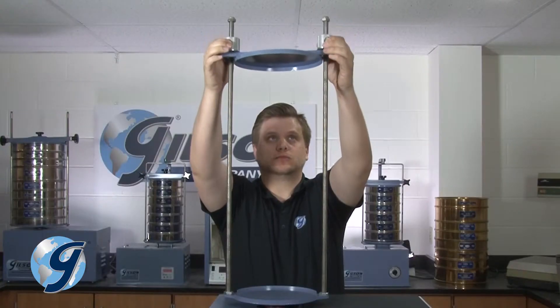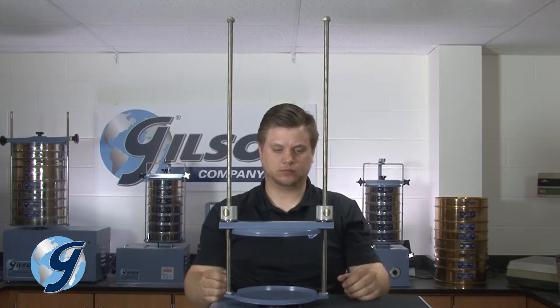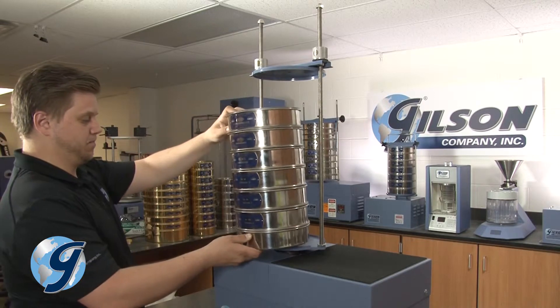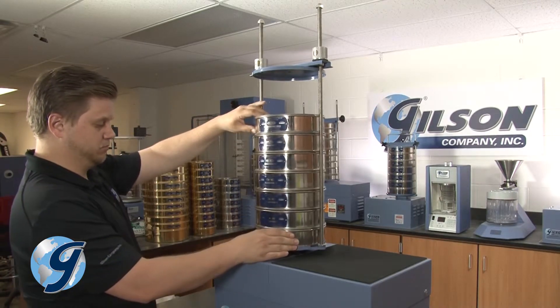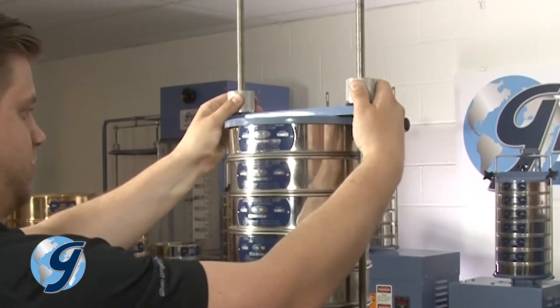Test the easy clamp system by depressing the push button and sliding the compression sleeve up and down. Further test the easy clamp system by placing a sieve stack onto the bottom plate and lower the compression sleeve to the stack height.